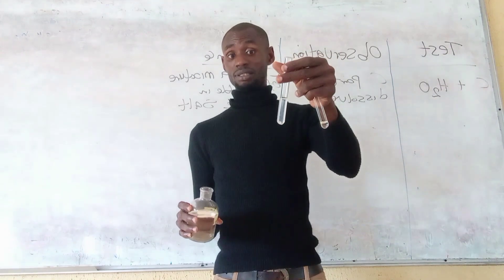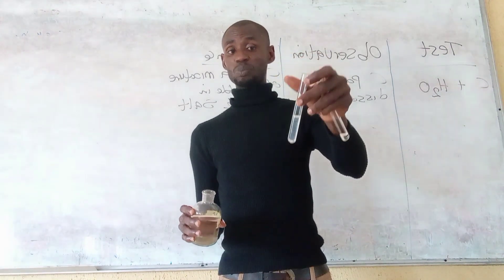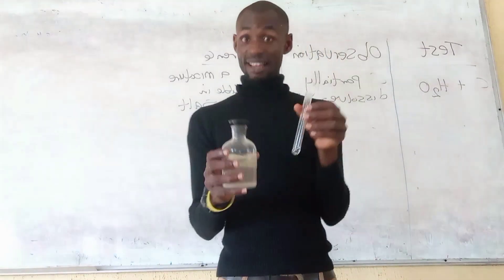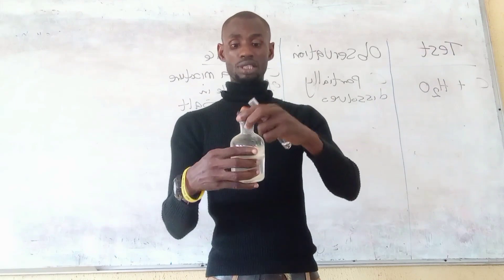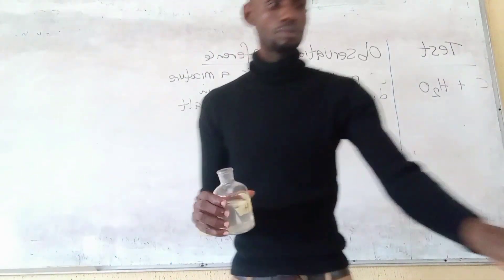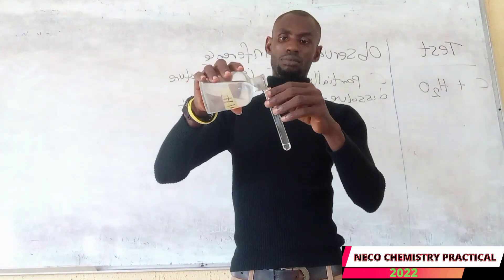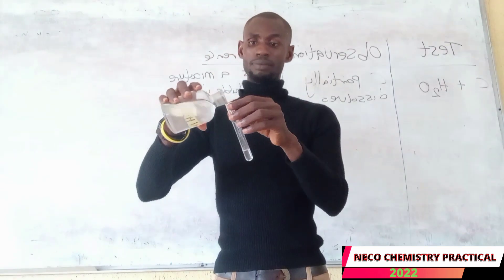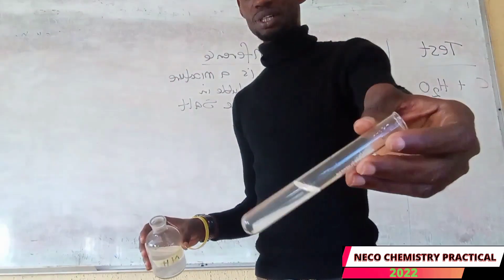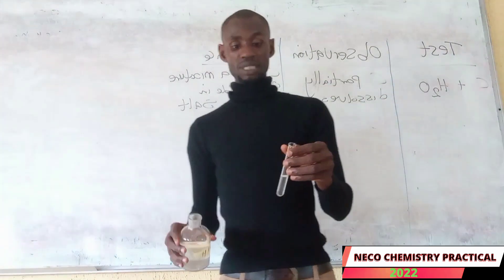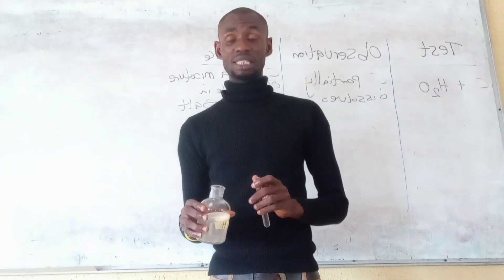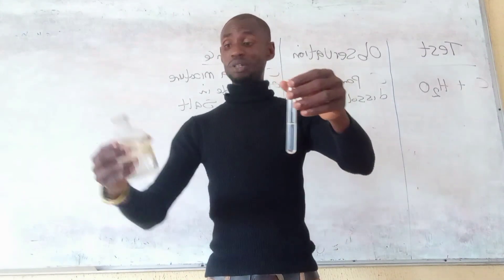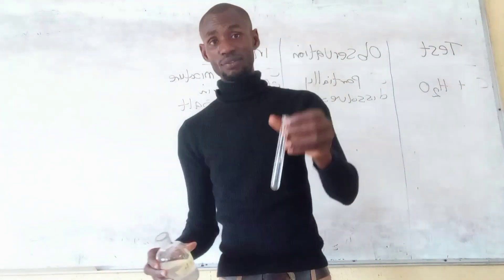A white gelatinous precipitate at the observation stage indicates two suspected ions — supply them in the comment box. To the other portion of the residue I am adding aqueous ammonia. In drops, we observe a white gelatinous precipitate. In excess, the precipitate dissolves. A white gelatinous precipitate that dissolves in excess aqueous ammonia means we are testing for either zinc or aluminium ion — and with aqueous ammonia, we are actually confirming zinc ion.